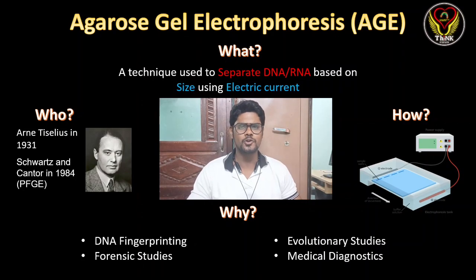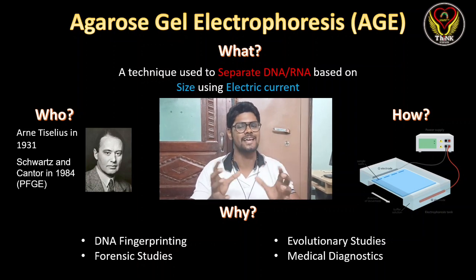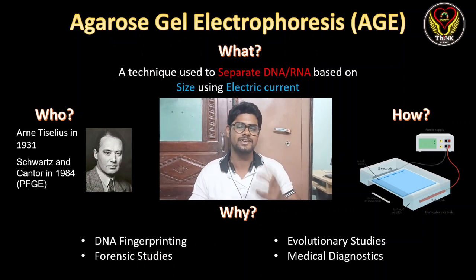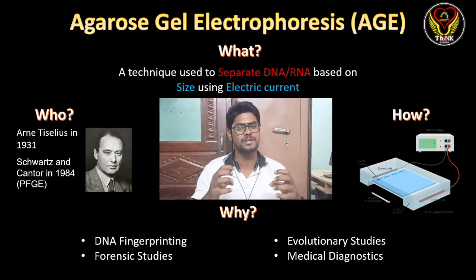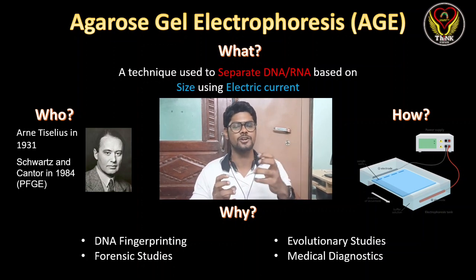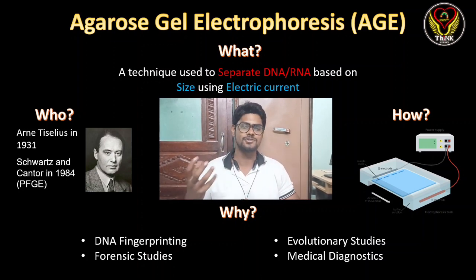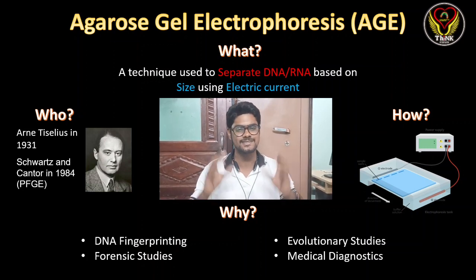In this video, we are going to look at another important molecular technique, which is AGE, Agarose gel electrophoresis. In short, we call it AGE. From the name itself, we can understand the meaning of the technique. Electrophoresis means separating molecules with electric current. Gel electrophoresis means we separate these molecules in a gel. And agarose means the gel is made up of agarose. So, agarose gel electrophoresis is this technique.